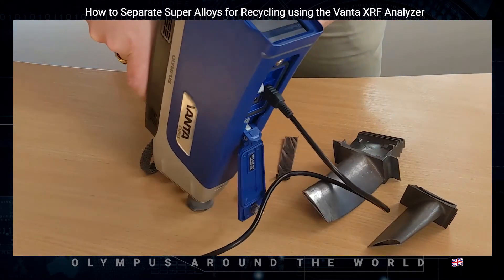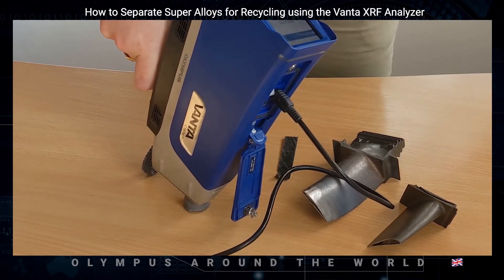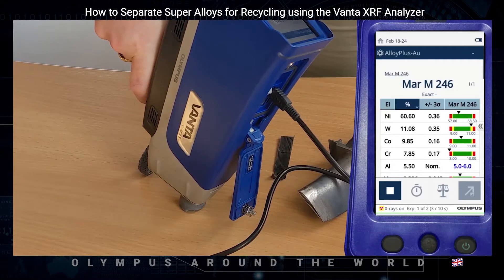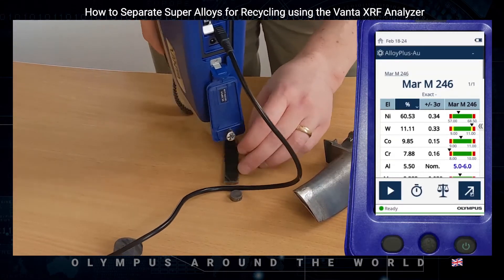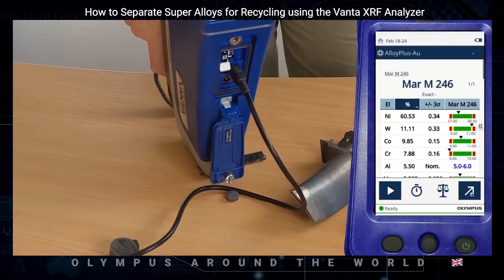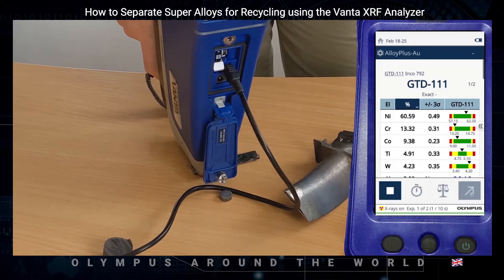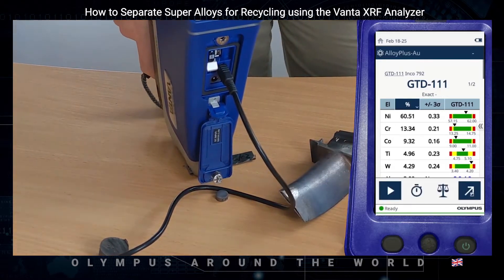So let's take a couple of measurements. We line the analyzer up, getting as flat as we can, move all our hands away, and then shoot the sample. That material is MARM246 Mirajin, and you can see very quickly — within two or three seconds — we get a good grade match, GTD111, for this sample.